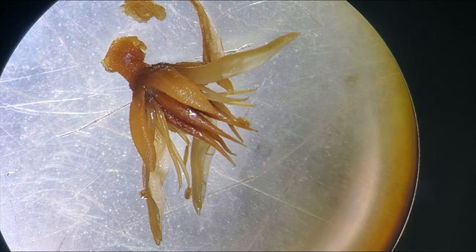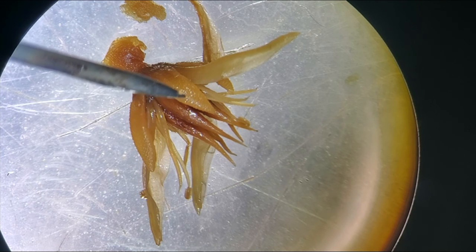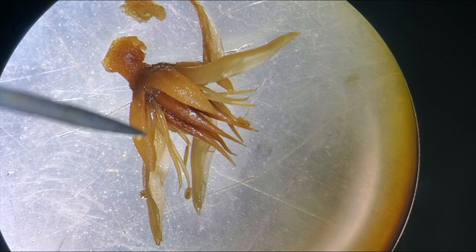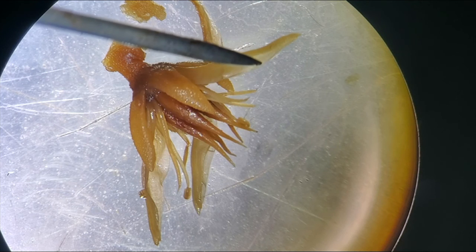So let's look at another flower from Sedum lanceolatum under the dissecting scope, this time in a slightly different view, but let's do the same thing real quick. Just identify each of the 4 floral whorls. The outermost whorl, again, is of course the calyx. And we see 2 sepals here, and of course there are 3 more composing the entire calyx. We have 5 sepal lobes in this plant. And then the next innermost whorl is the petals, which you can see here and here.